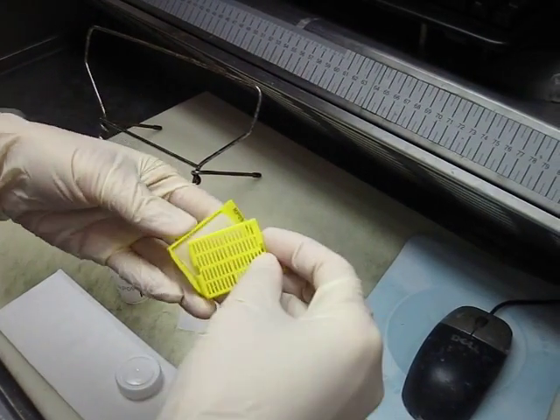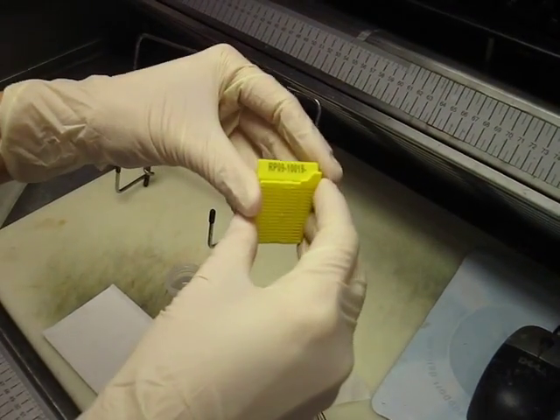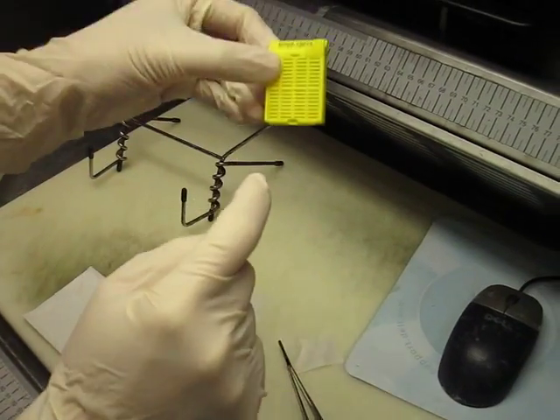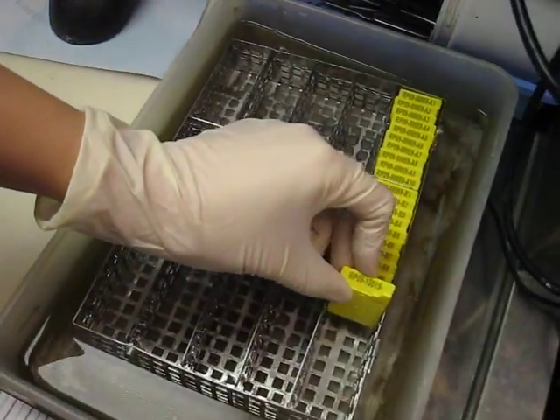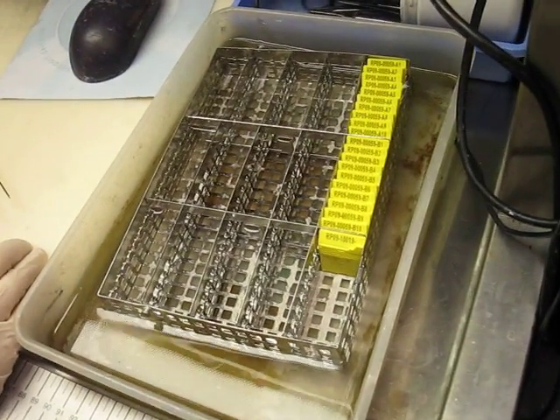And that report, when this specimen gets processed and put on a slide, goes to the physician that is going to be looking at this, and then that physician would have an idea of what this specimen looks like right now when we first received it. And then after we do that, we put it together with the rest of the specimen. This is just a formalin bath, and then this will be sent to the machine at the end of the day and processed.